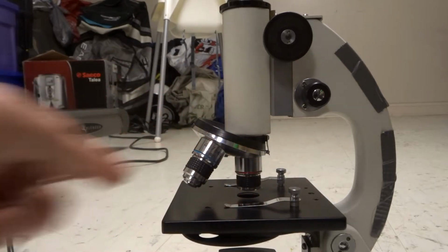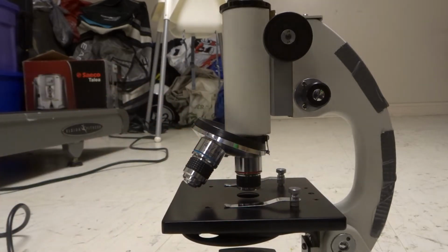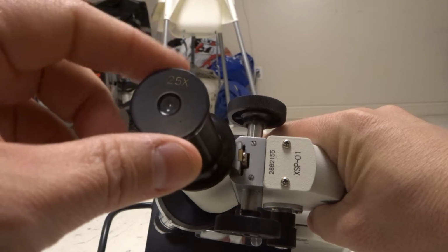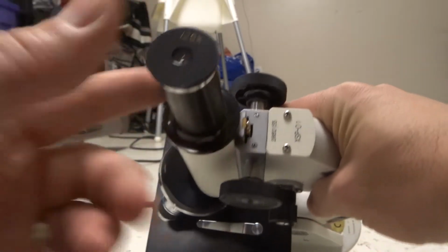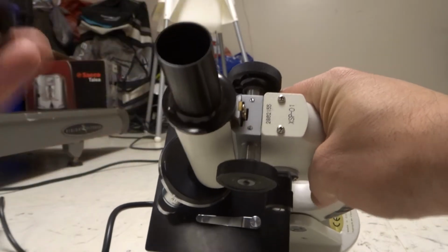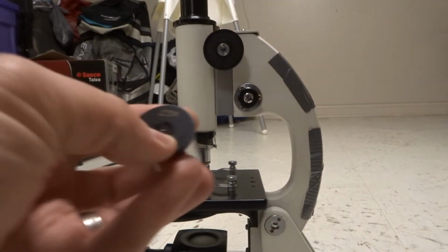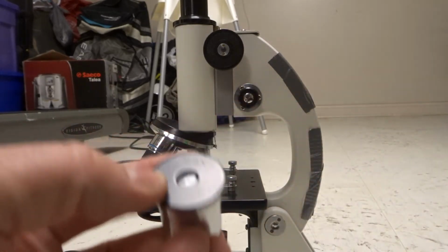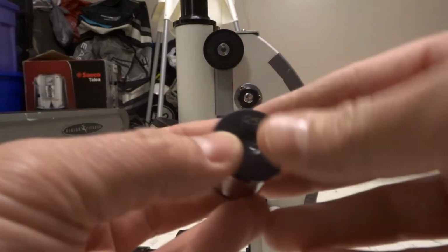It usually will say right on the lens. But most of the time, there's going to be an additional factor of magnification that you need to take into account. And that is going to be your eyepiece lens or your ocular lens. As you can see right here, most of the time, your ocular lens is going to be a 10 times magnification. But this one right here, because it's a little bit of an old school microscope, this is actually 12.5 times, and it's got a removable magnification lens. You can exchange it with different options.